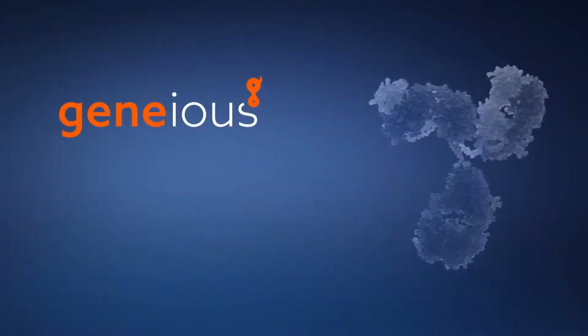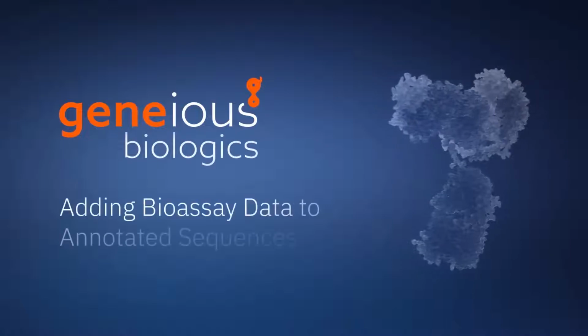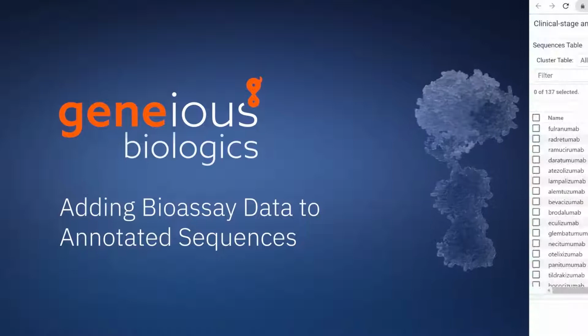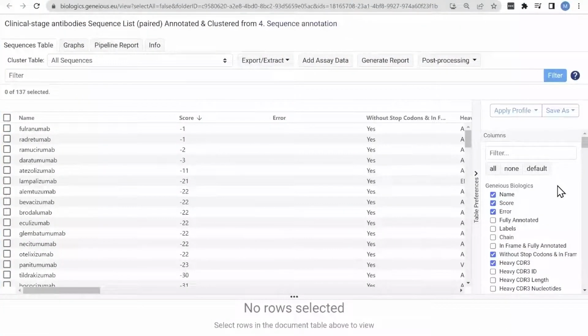Welcome to this Geneious Biologics video on adding bioassay data to annotated sequences and creating and using labels. Bioassay data coupled with sequence annotation, liability scores, and germline gene differences can aid in antibody candidate selection.